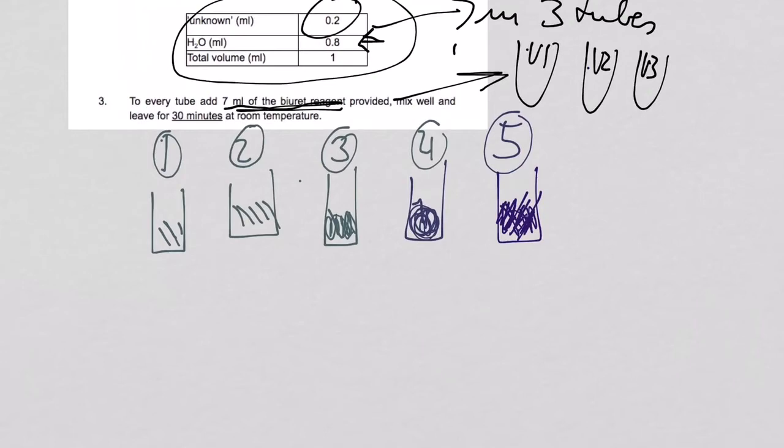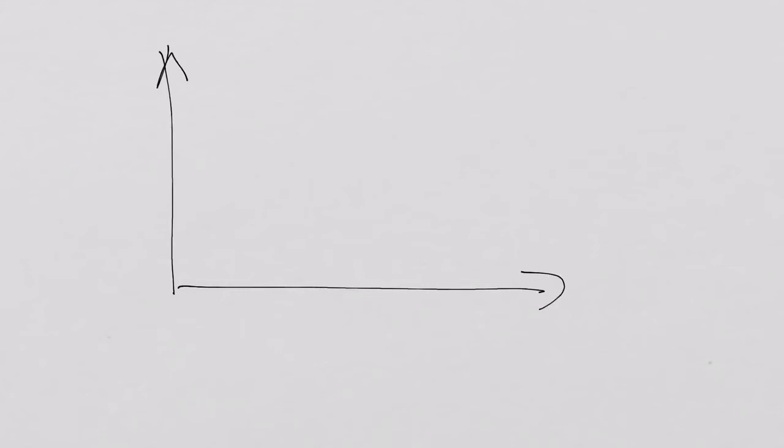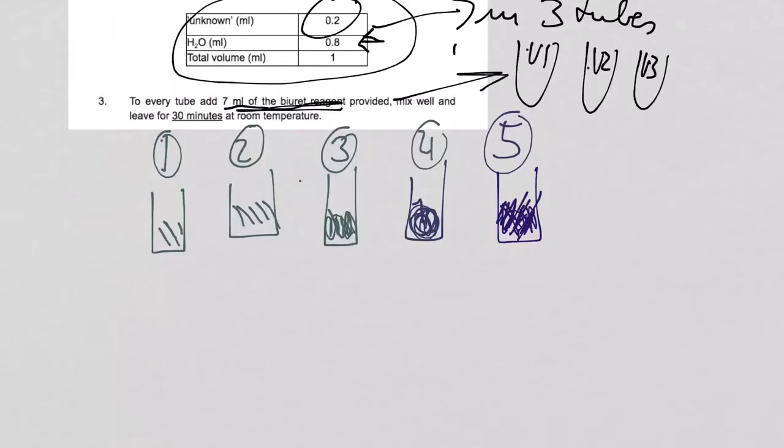You then measure your standard, the absorbance. Now, the first tube that should not contain any protein, that is the sample that you use to zero your spec.